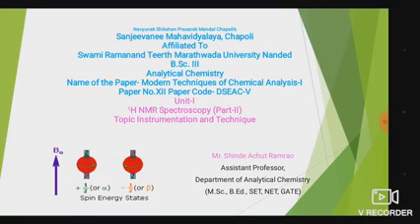Third year students of analytical chemistry. Here we are going to learn about H1 NMR spectroscopy. In the last lecture we learned about the theory of H1 NMR spectroscopy and what requirements there are for H1 NMR. H1 means proton nuclear magnetic resonance spectroscopy.